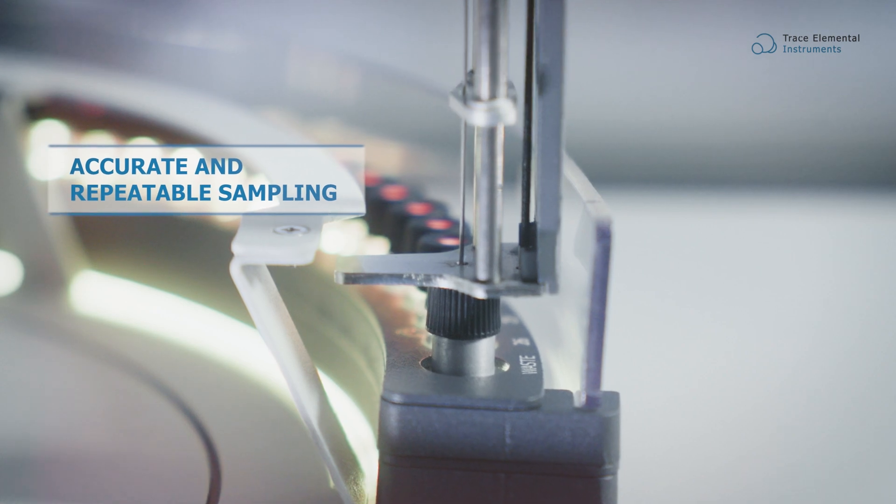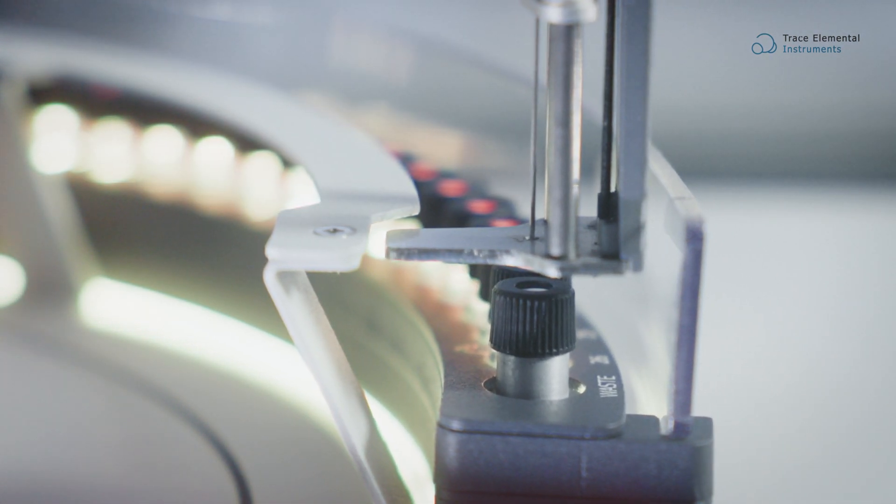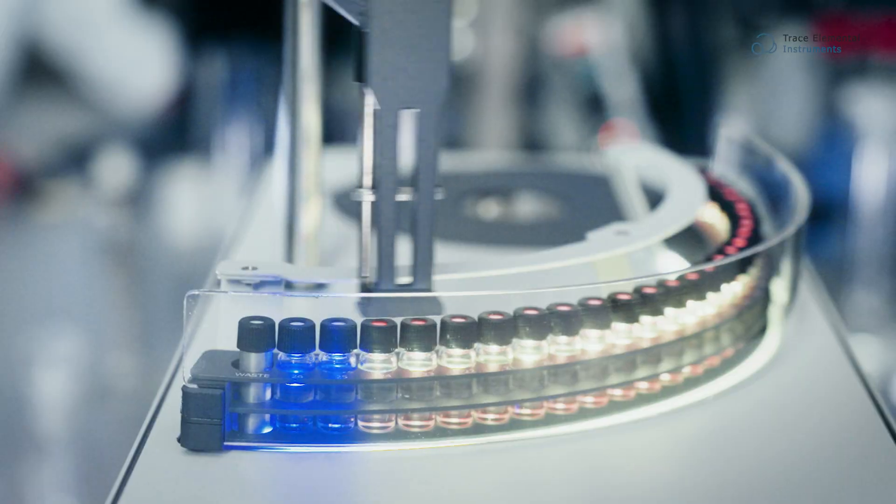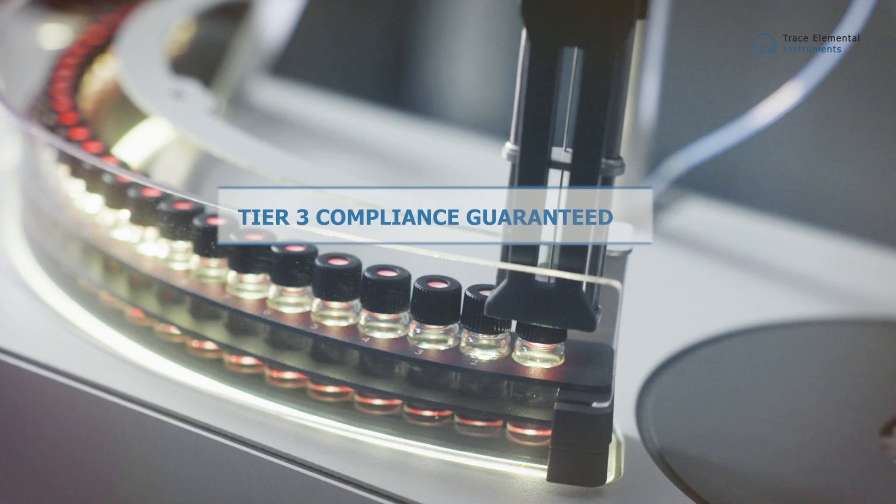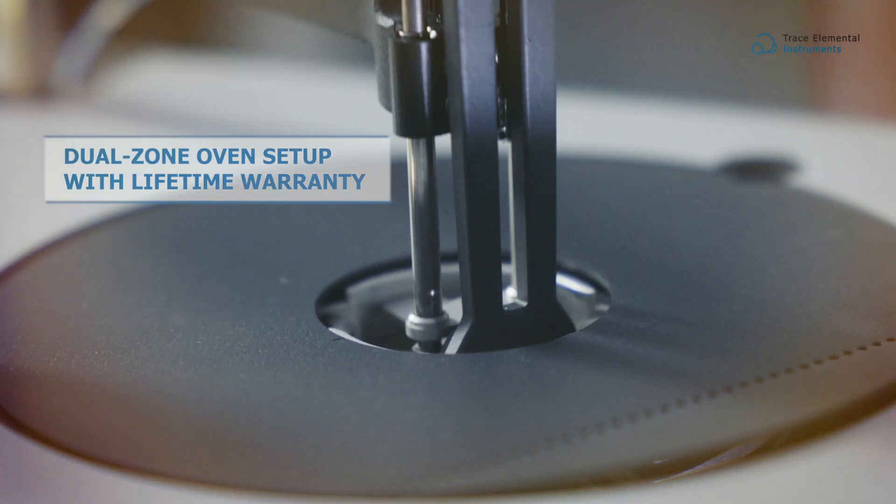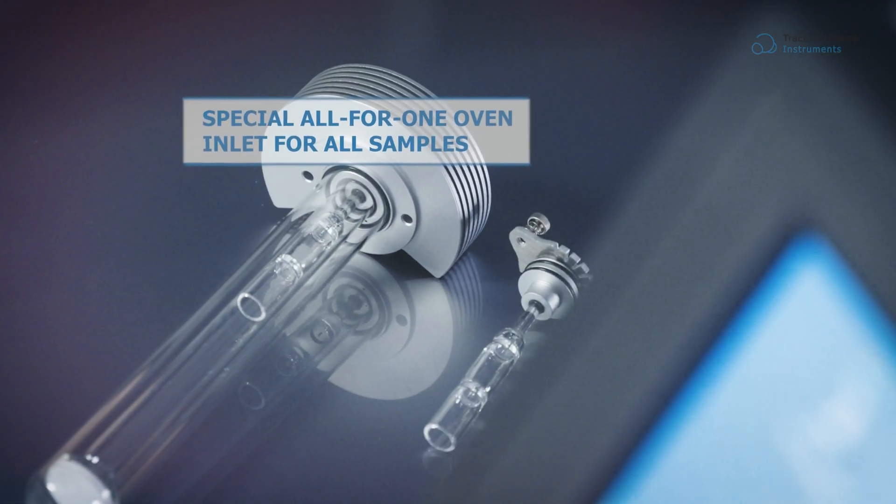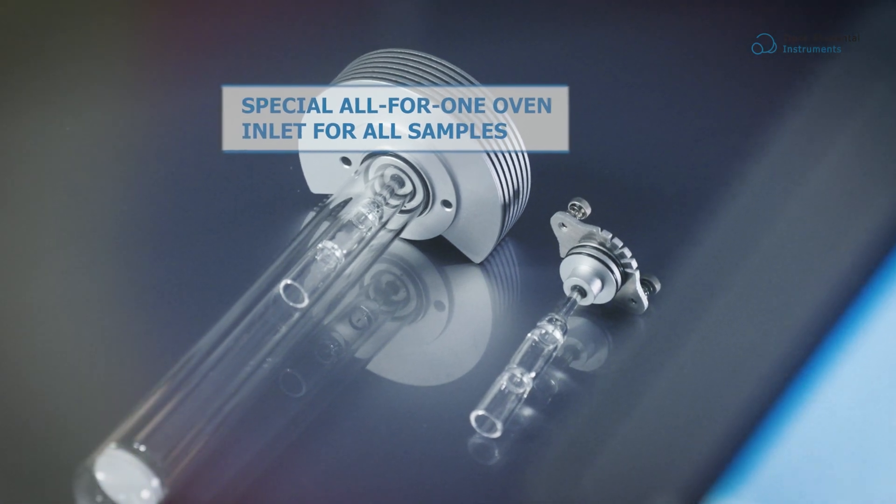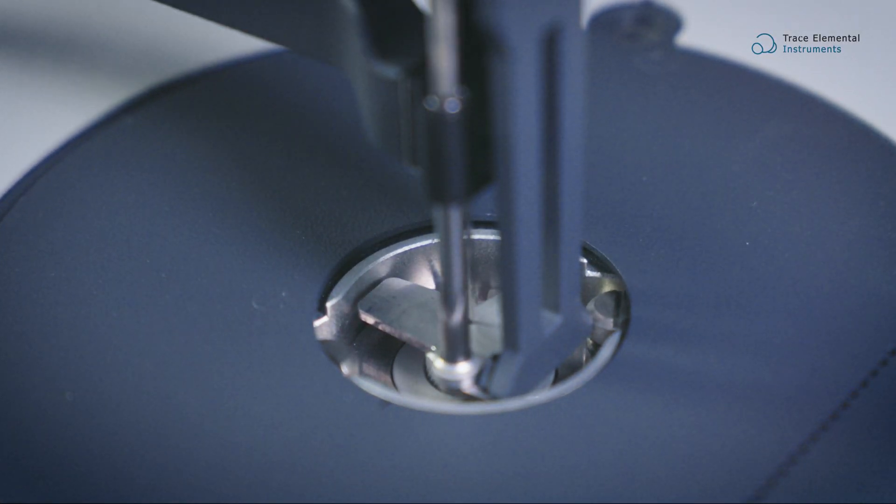Getting fast and accurate stable results is achievable on the Explorer V system. This is due to the combination of an internal microliter syringe for the liquid treatment steps and a state-of-the-art developed combustion furnace setup. Every sample is injected perfectly in a special temperature-controlled dual-zone oven setup. A well-designed all-for-one oven inlet makes injections possible for a broad range of samples, ranging from lower to higher boiling ranges.